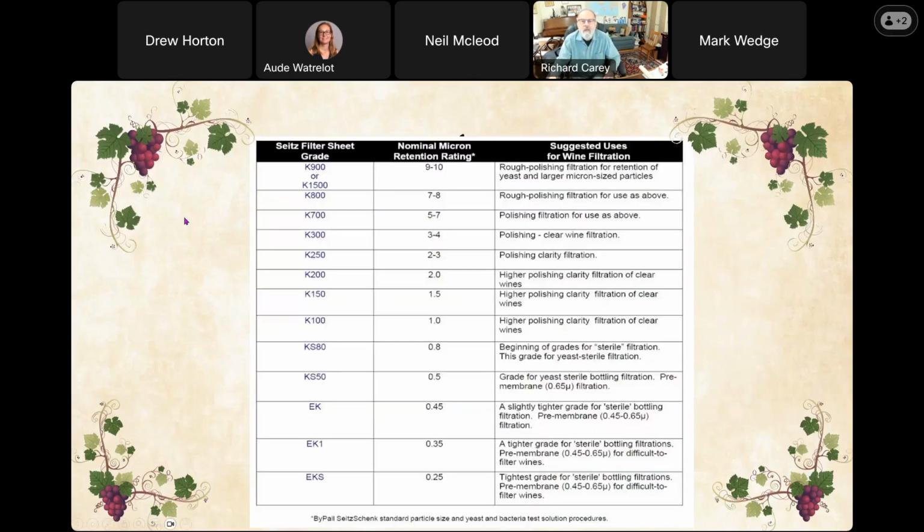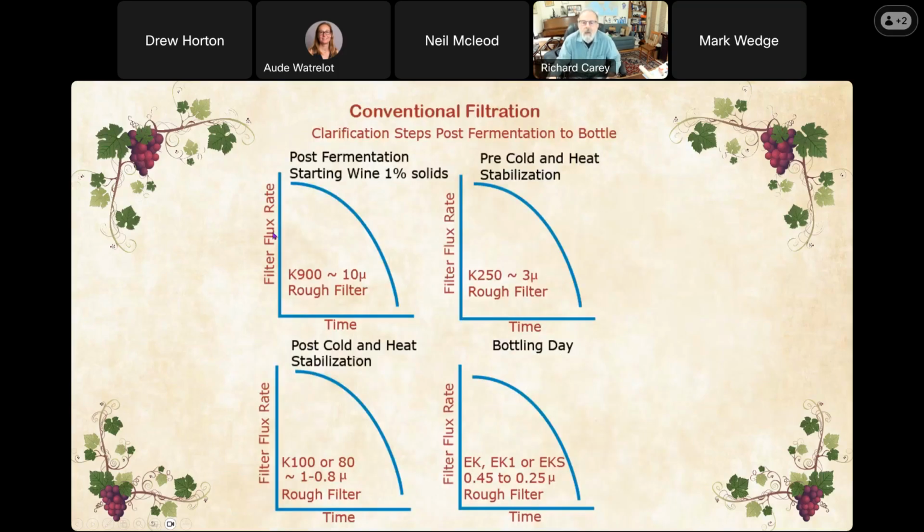This is basically the same kind of unit, just a different filter company name, and you break your regular filters down into anywhere from 3 to 4 filtrations, depending upon what you want to do. When you're looking at conventional filtration, you start off with each of these dropping down and giving you a different flux rate, because this is the kind of curve that you get when you are filtering in each one of them.